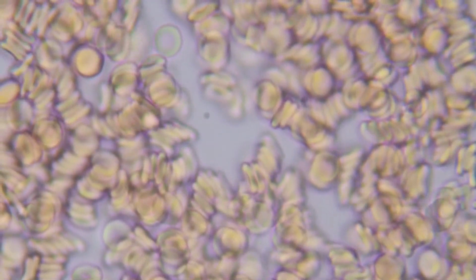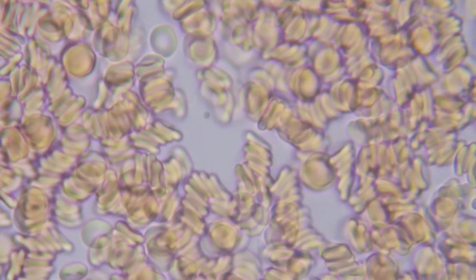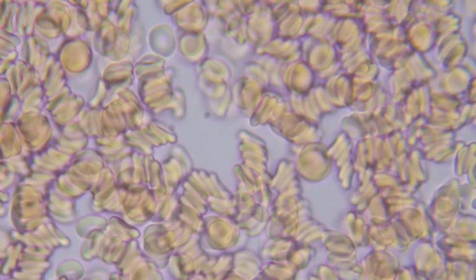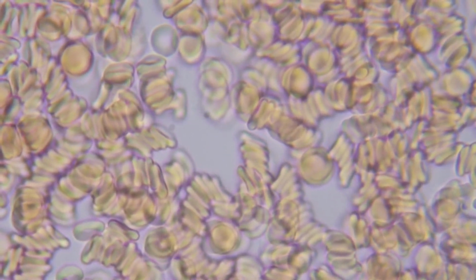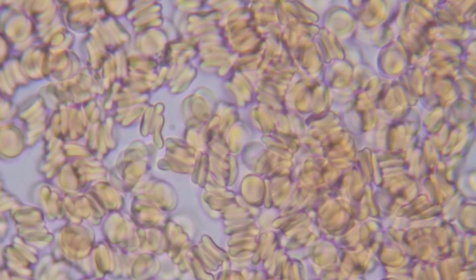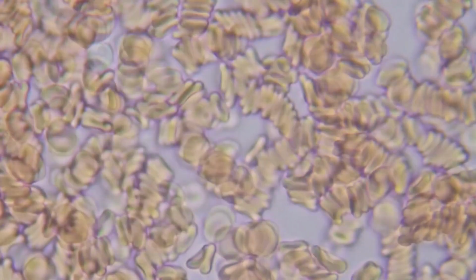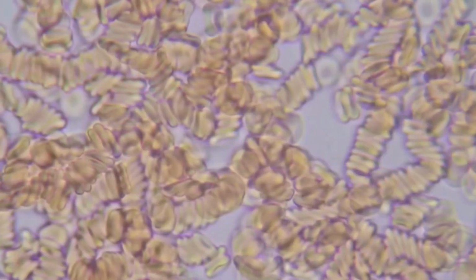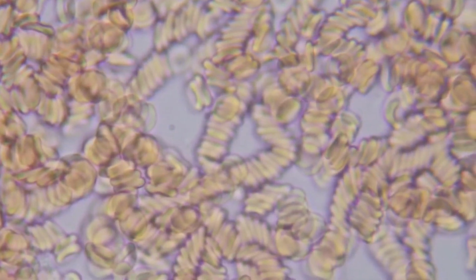At this moment, we are observing the blood at a magnification of 2,500 times. And here, it is exceptionally easy to see that these rouleau formations have gotten significantly longer. That provides us with a significant amount of valuable information. But most importantly, it shows us that the blood has become significantly more acidic, and you can see that very clearly with this noticeable change.